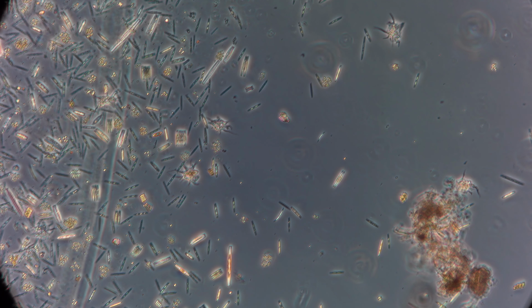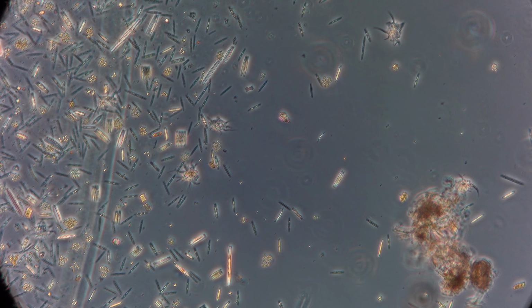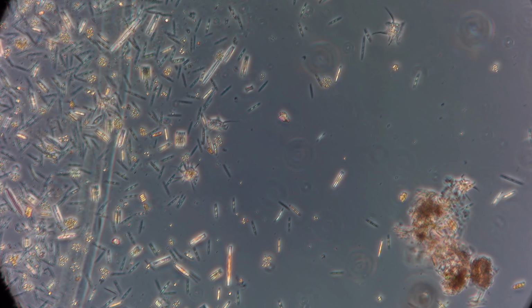This is kind of boring. But what is this little area there? That's an algae. Is it moving or is the diatom? I think it's stuck to the diatom. Oh, holy crap! There's 2 amoebas. Wow. This culture really took off. Is that another one? Yep. Wow, this is like an amoeba culture.